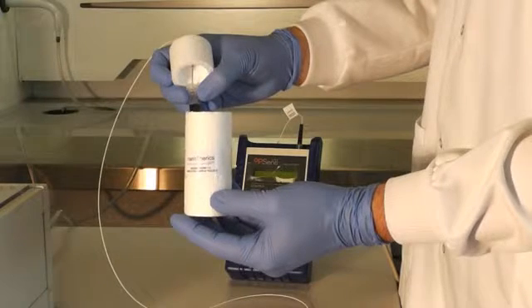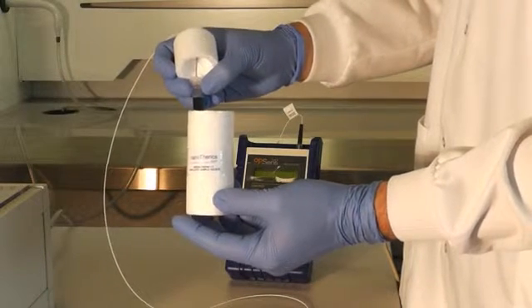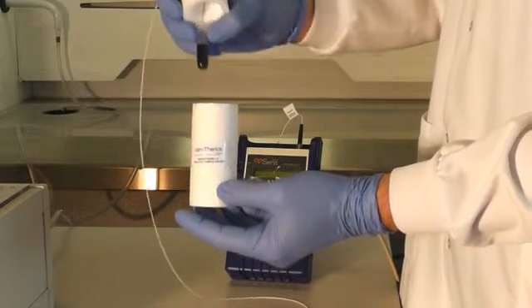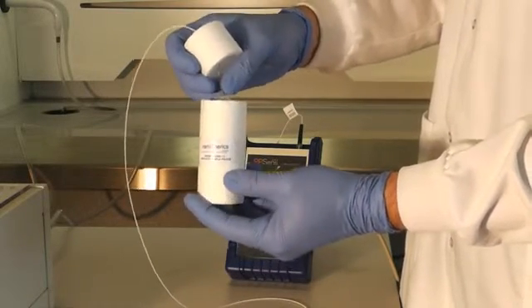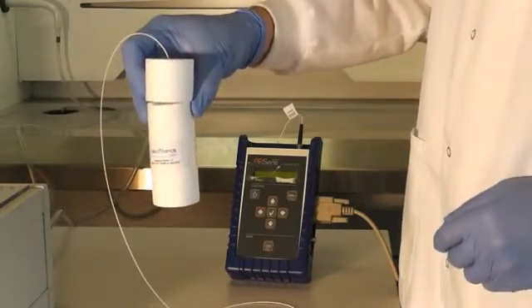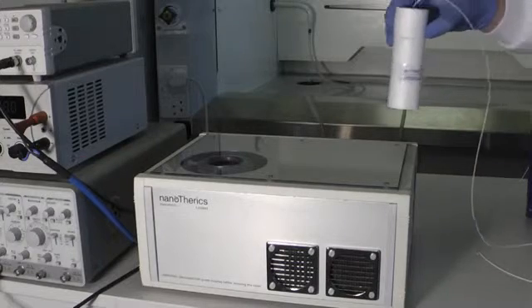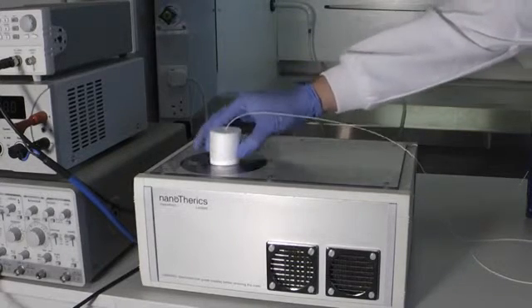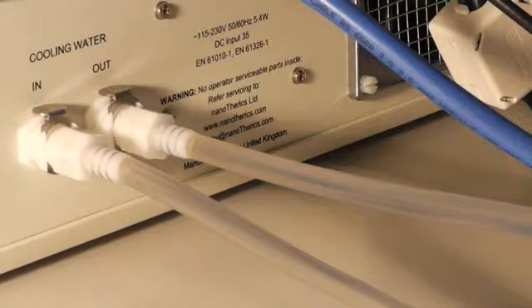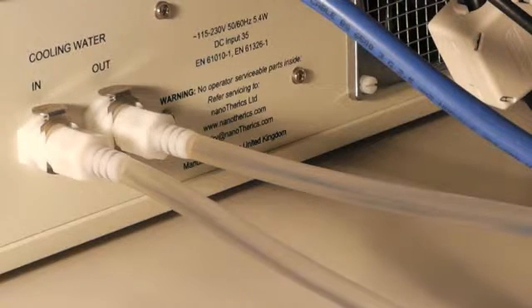Now take the sample, make sure it is in contact with the optical probe, in this case connected to a single channel optical probe interface which monitors real-time temperature variation within the sample. Place the test sample within the polystyrene tube to avoid non-specific heating, which is already enabled by running cooling water within the coil and also by separating the coil from the sample by the polycarbonate wall.